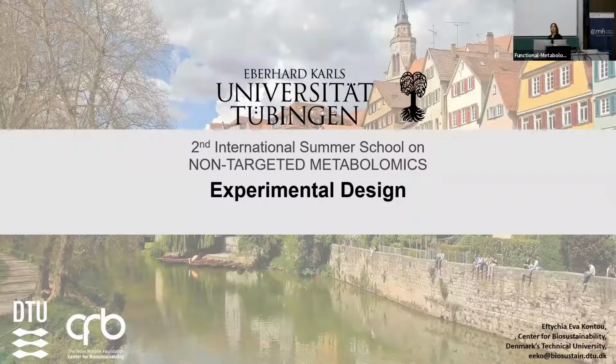I think me, Martin, and Daniel will be presenting experimental design, QA/QC, MS data acquisition, and some projects that we have, some really interesting projects. Okay, so we're starting with experimental design.